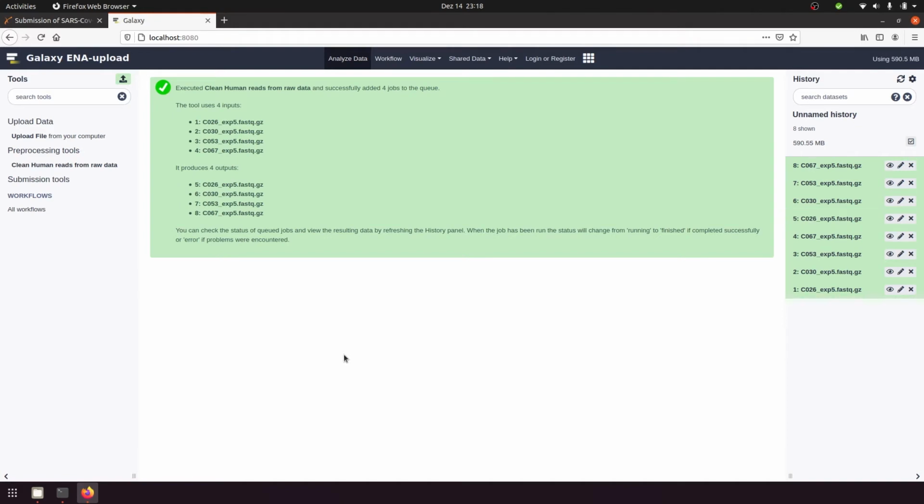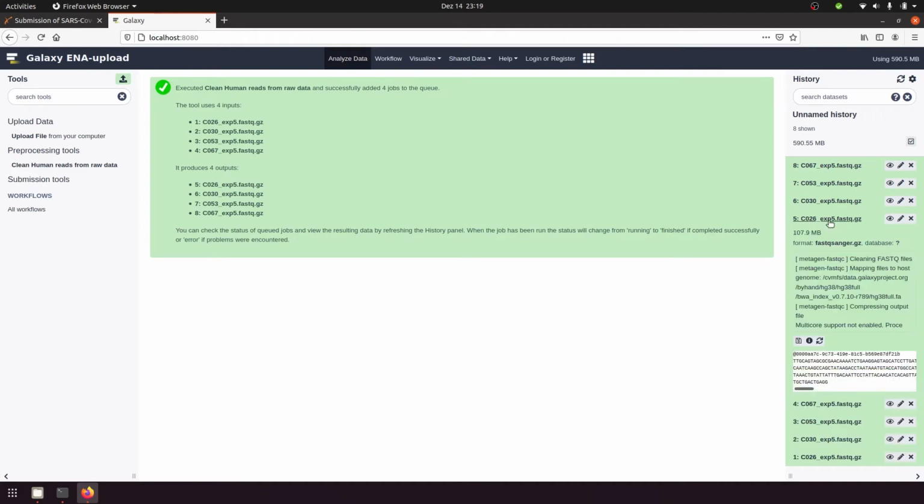To validate this step ran as expected, check the file size of the output files. They should be in the same order of magnitude as your input file. If they are not, something went wrong. This can be, for example, due to the lack of sufficient memory on the device to perform this step.